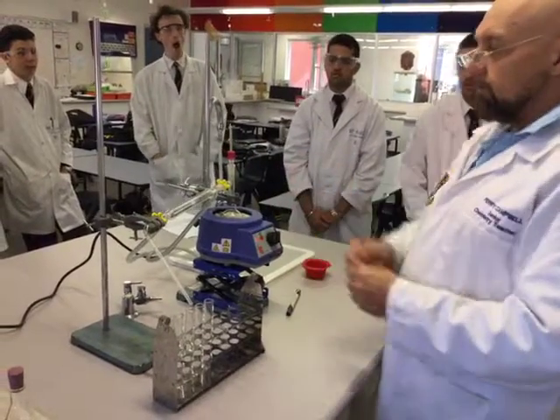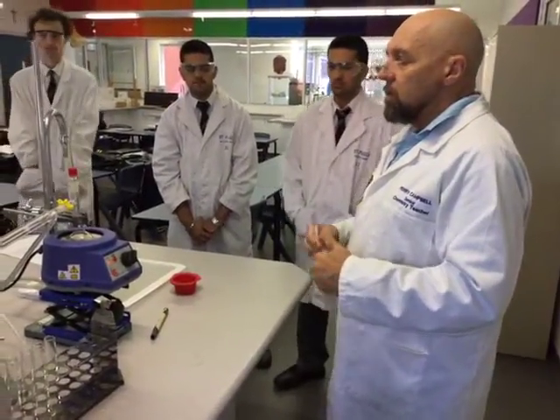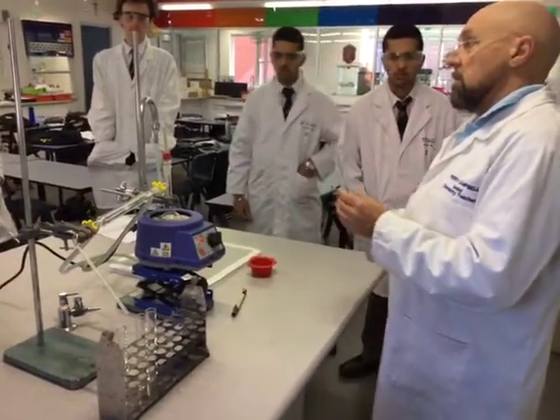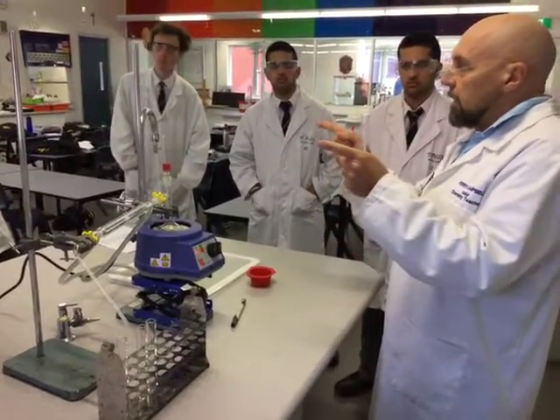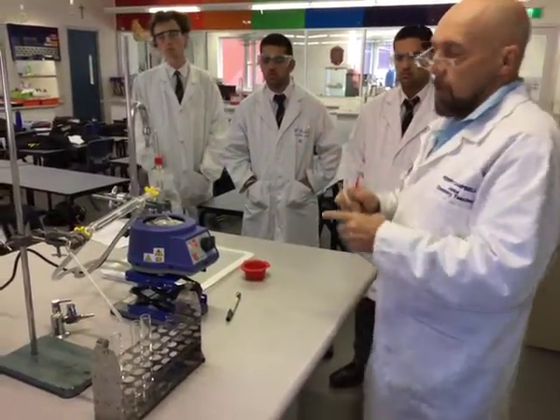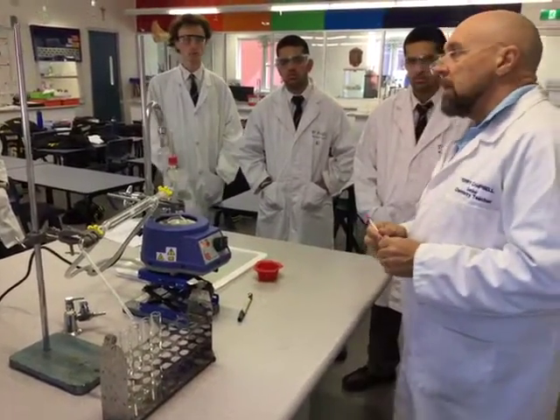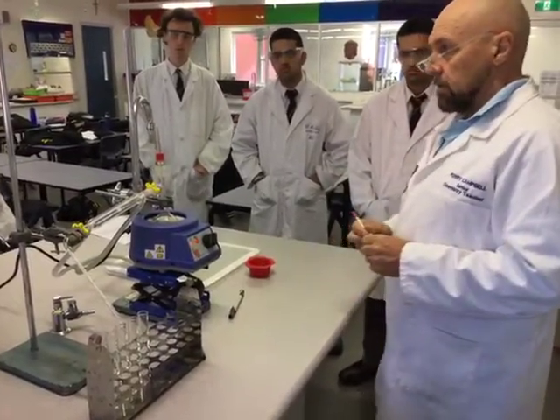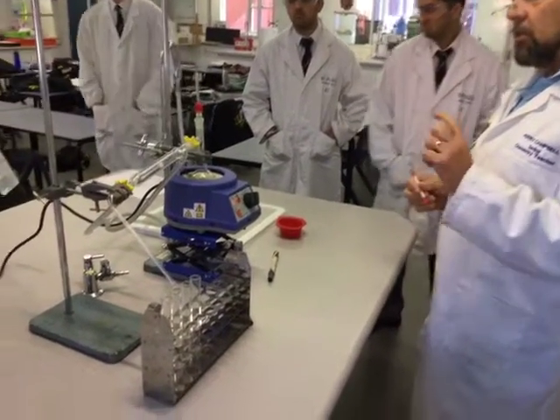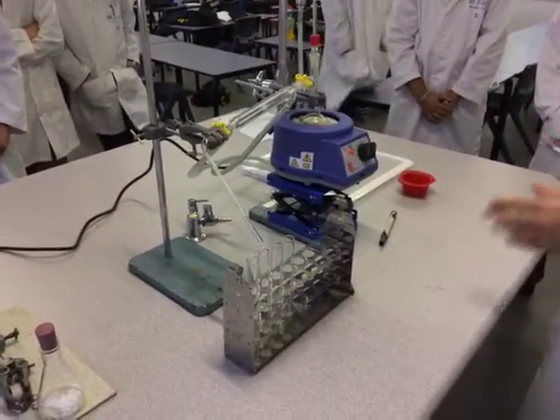We do one distillation — we haven't got the time for two, unfortunately. What would a second distillation do? It would purify the ester. We would run it through the whole distillation process again and narrow our collection temperature down — then we'd do 124 to 128. You can also do a boiling point test on the products you're collecting, though I can't go through the theory for that right now. Obviously we also talked about chromatography as another way of checking purity.